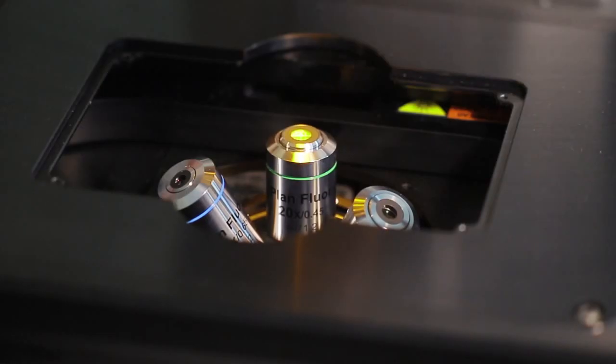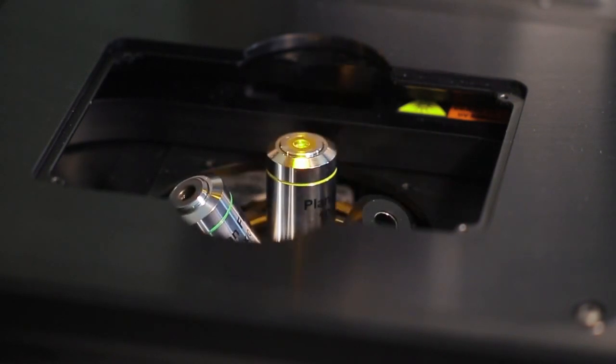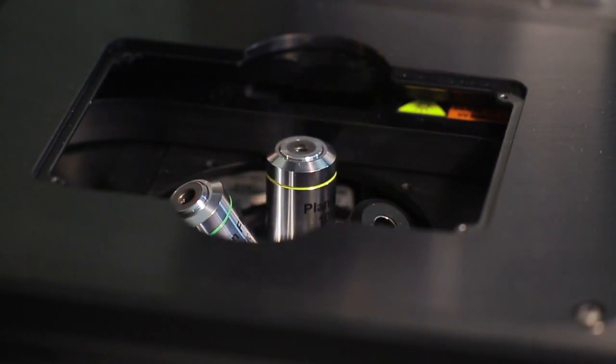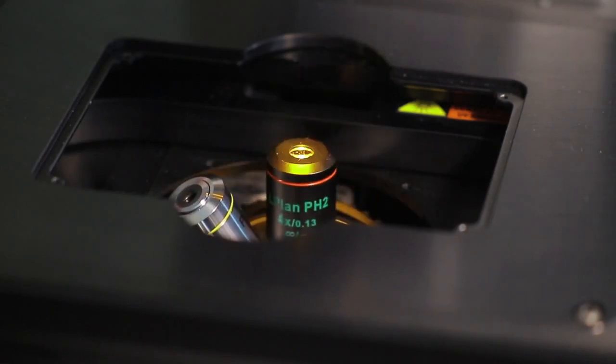With positions for four individual light cubes and five individual objectives, the EVOS FL Auto gives you the flexibility to match a wide range of research applications.